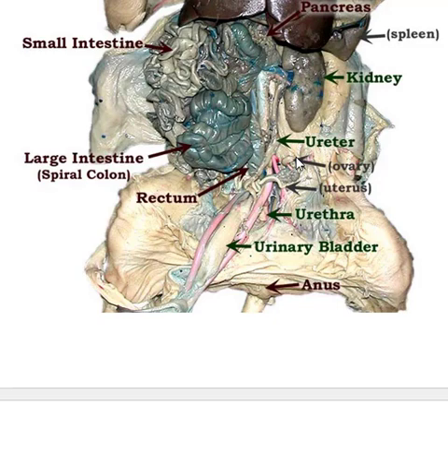This is a female pig. You can see her small ovary — looks like a little bean. Her uterus is very small because this is a fetal pig that was taken from its mother before being fully formed, then injected with different colored dyes so we could see the various parts.